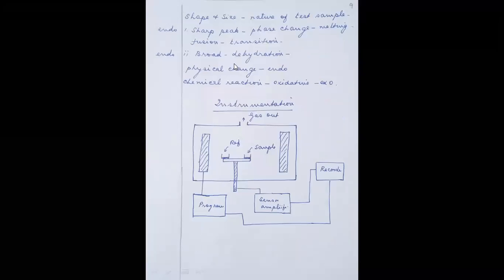So what are all the important factors in the curve which will give you useful pieces of information? The shape and the size. What is the shape of the graph and what is the size of the curve?